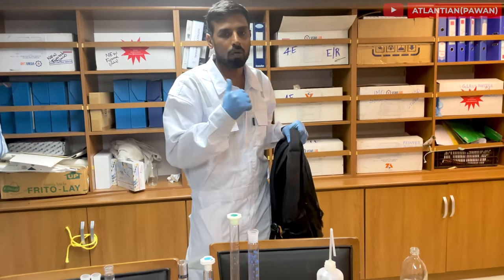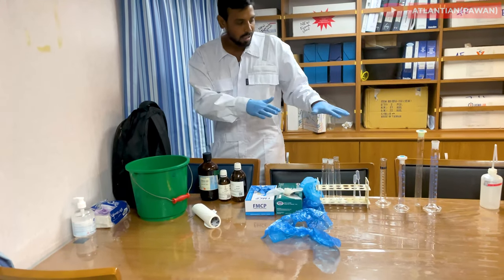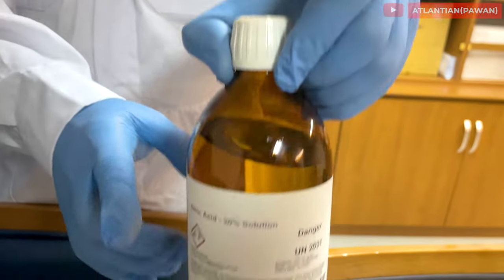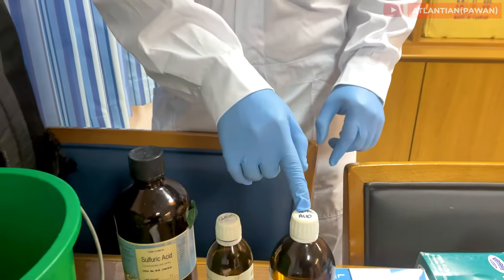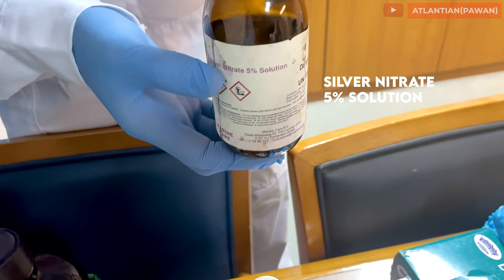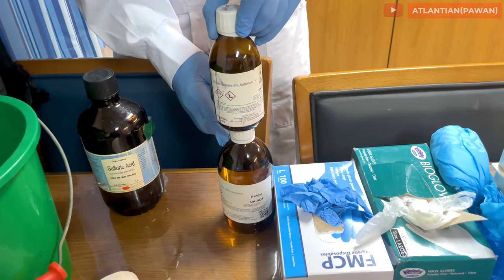Other than the equipment, there are three chemicals you must have. First is nitric acid at 20% solution — I've marked it on the cap for easy reference. Then there is silver nitrate at 5% solution. These two bottles are required for the chloride test when doing chloride testing on your wall wash samples.